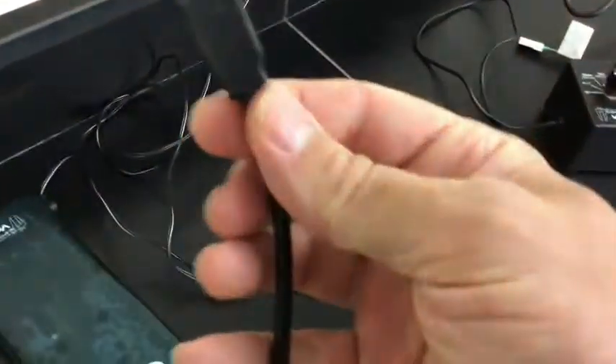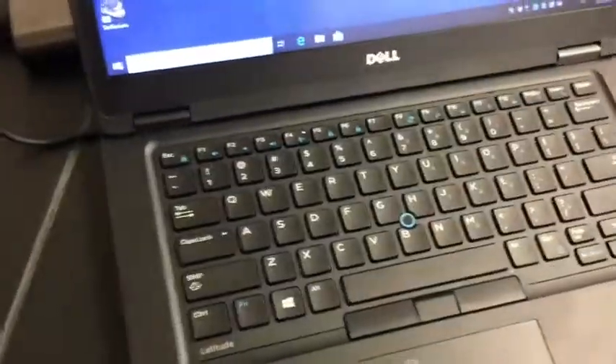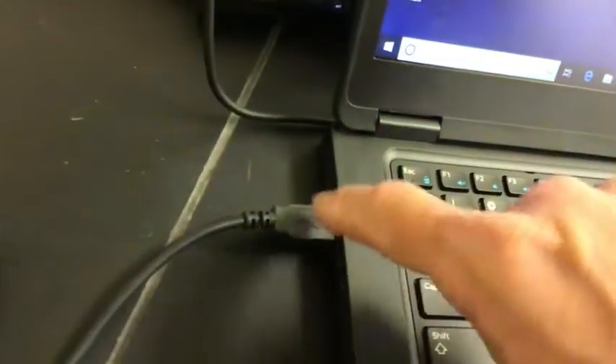Now we are going to connect the USB end to any one of the USB slots on the computer. Go ahead and put it in right there into any available USB slot. Now it is connected.